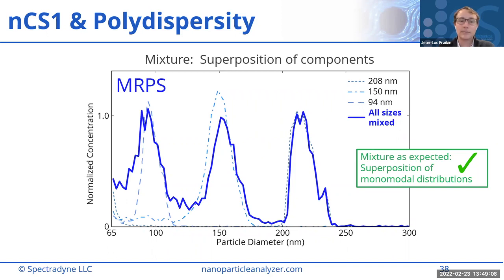So just to clarify, to study a complex polydispersed sample or unknown sample, how many different ranges should be exploited to just make sure you're not missing smaller stuff, bigger stuff? Good question. So most of our customers, when they first get a system, they get a broad range of cartridge sizes. So currently it takes 3 cartridge sizes to span from 50 nanometers all the way to 10 microns, I think is right.